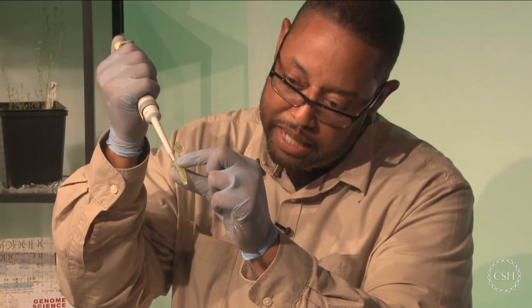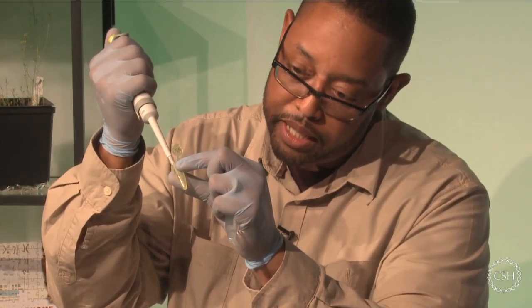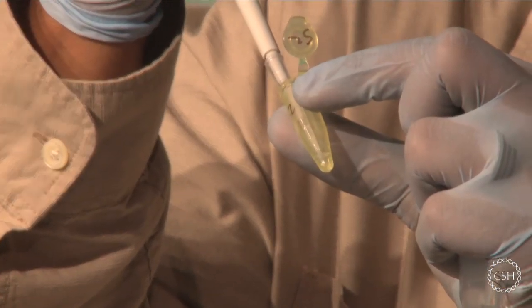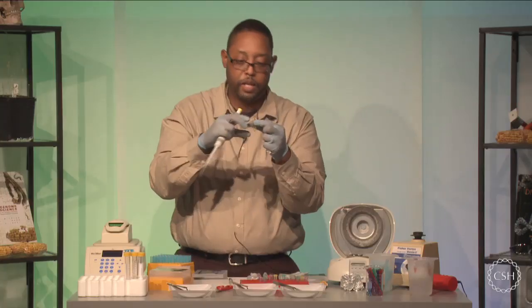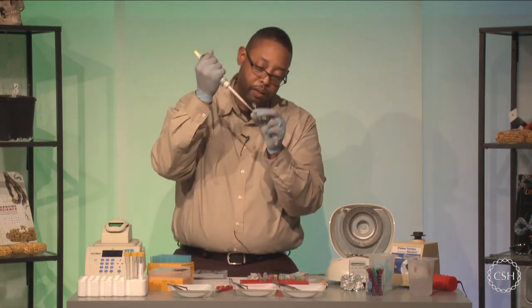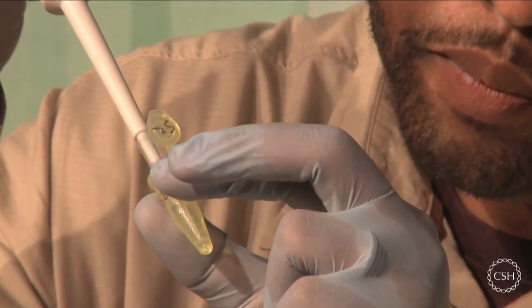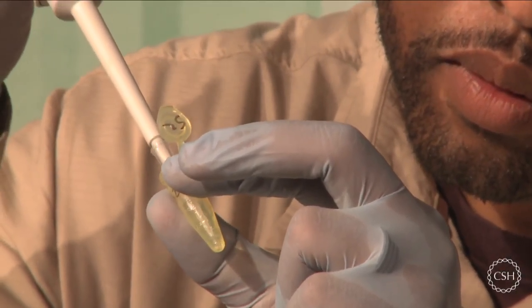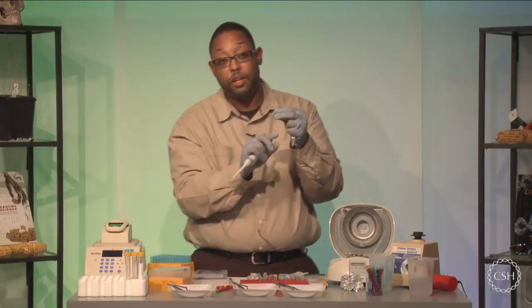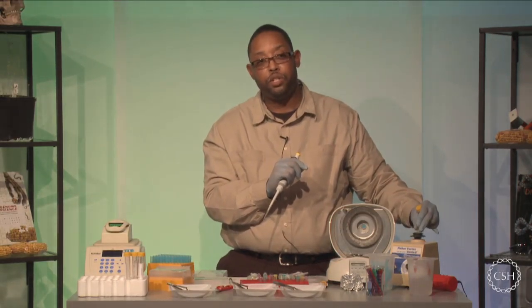And then I'm going to pipette up and down while I'm in there, disrupting my silica resin pellet. You can see that I'm pipetting up and down, and I'm basically trying to get my pellet to go back into solution. Okay? If it's giving you a little bit of trouble, you can finger vortex. But what I like to do is, with my tip, get down in there and try to crush this pellet back into solution. Once you can see that it's back into solution, you can either finger vortex to make sure you're getting good mixing, or you can go back to your vortexer itself to ensure proper mixing.